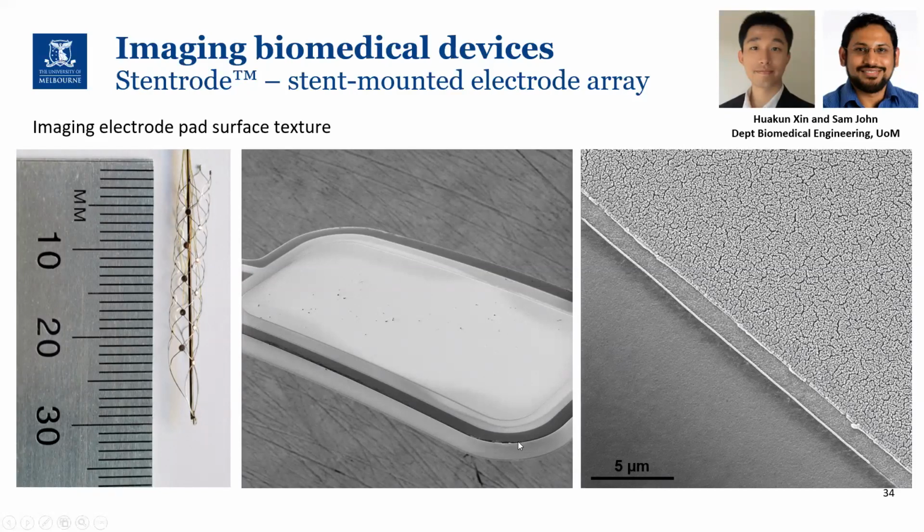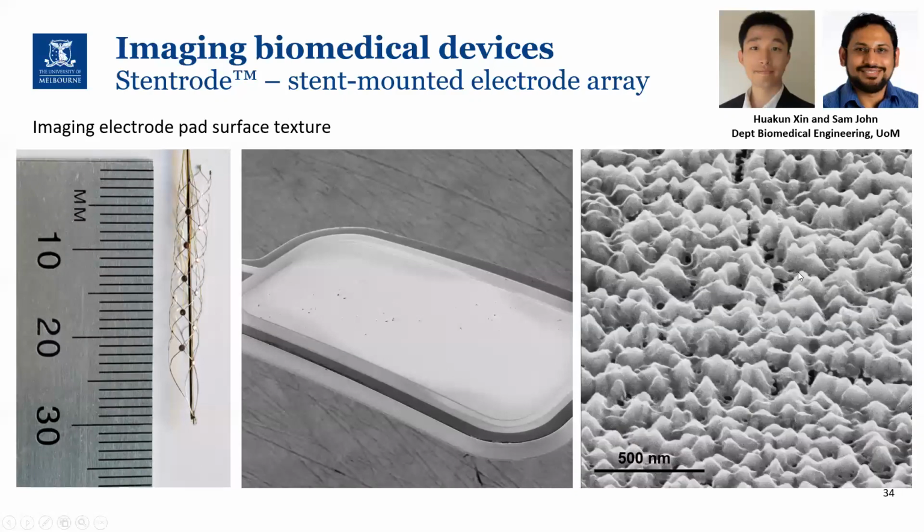These are what some of the pads look like. They're very, very small, thin metallic pads with a conductive surface on the top. And you can imagine that the surface area of those pads is very important for the electrical contact. So these researchers are interested in what's happening at the interface between these deposited layers and what is happening at the surface before and after usage. So we zoom right in on these and we look at the surface texture of these contact pads and monitor how these change with usage and under different conditions.